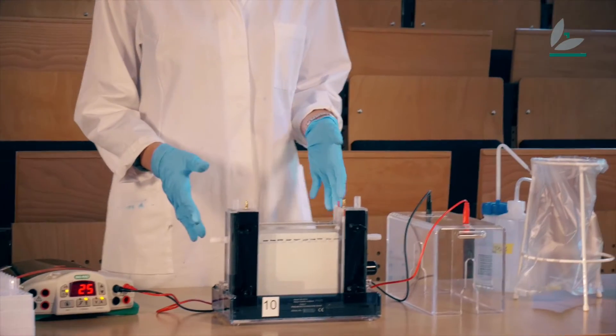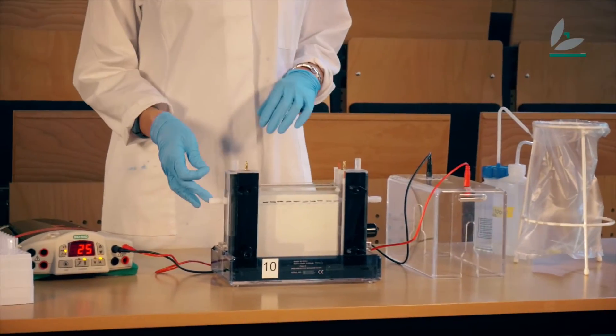So first I will bring the components that I'm interested in into solution — that's something that I've already prepared here. Right now I'm interested in proteins, so I've prepared a protein gel. But gel electrophoresis can also be used for DNA and RNA. It's just that it looks a little bit different.